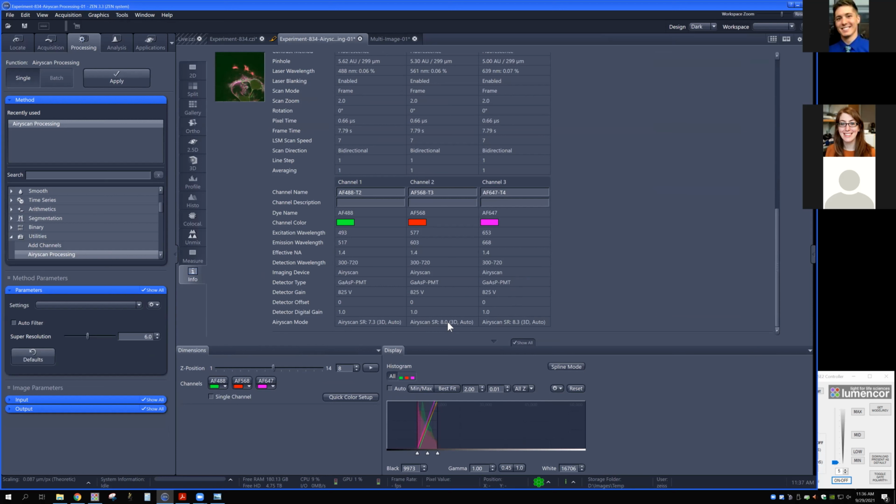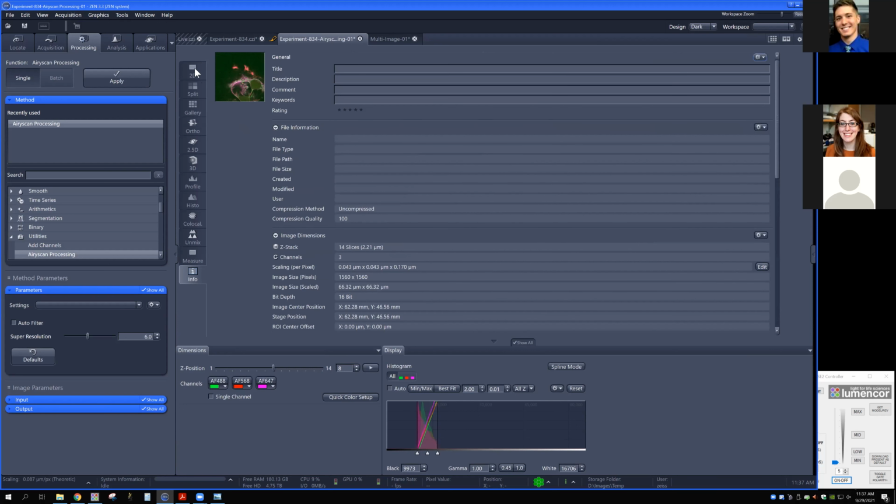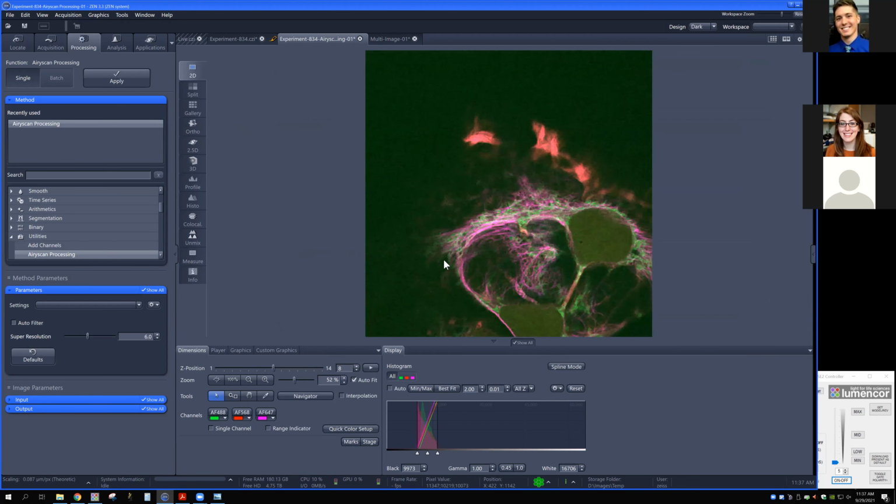And basically, I'll usually try not to go much more than about 0.5 over what this one is right here. So I want to show you what it looks like if I go a full 1 or 1.5 over this, just to give you an idea of what the deconvolution artifact is always going to look like.